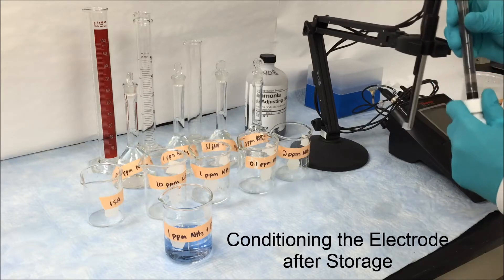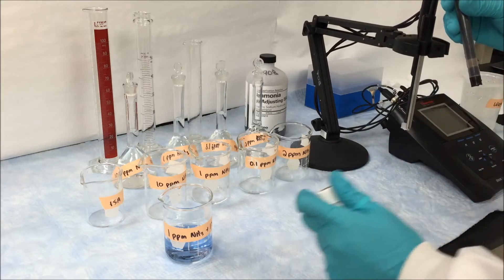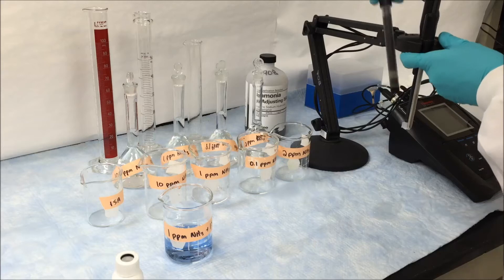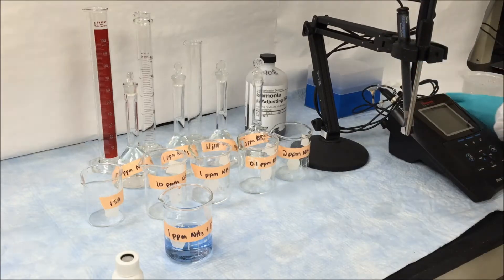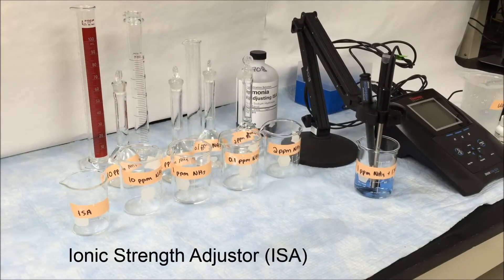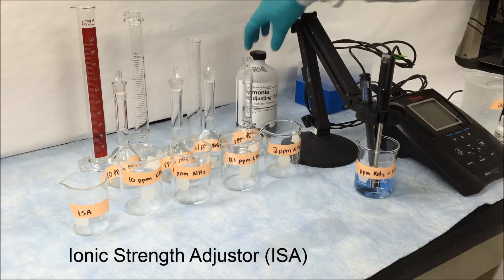First take the electrode out of the storage solution making sure not to create a vacuum. We suggest that you place your ammonia electrode in your mid-level standard with ISA for about 10 to 15 minutes before you start to perform your calibration.